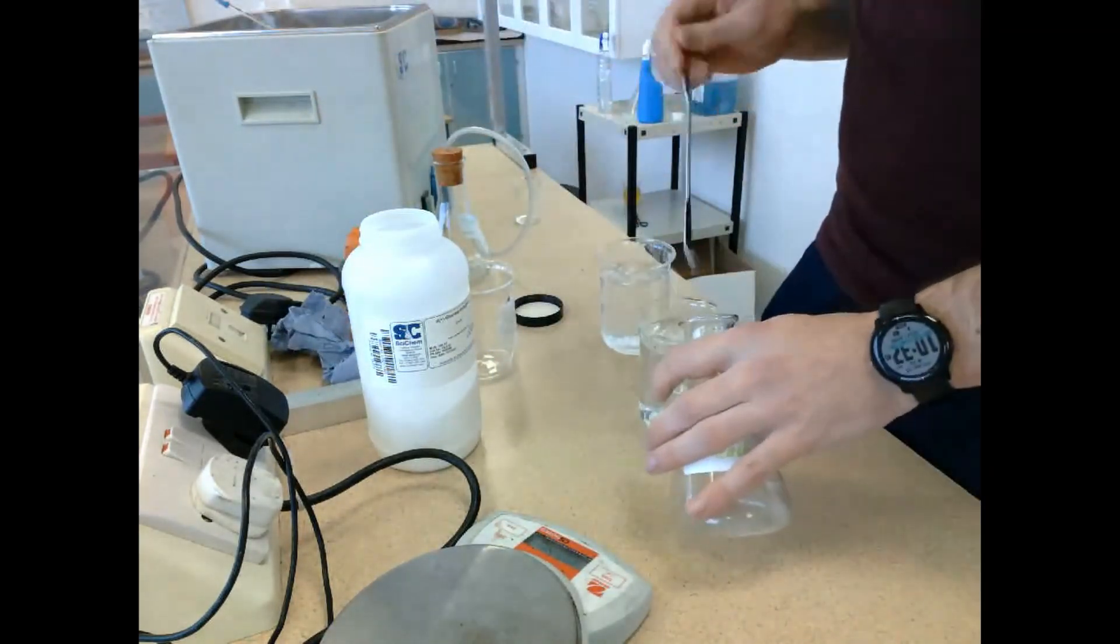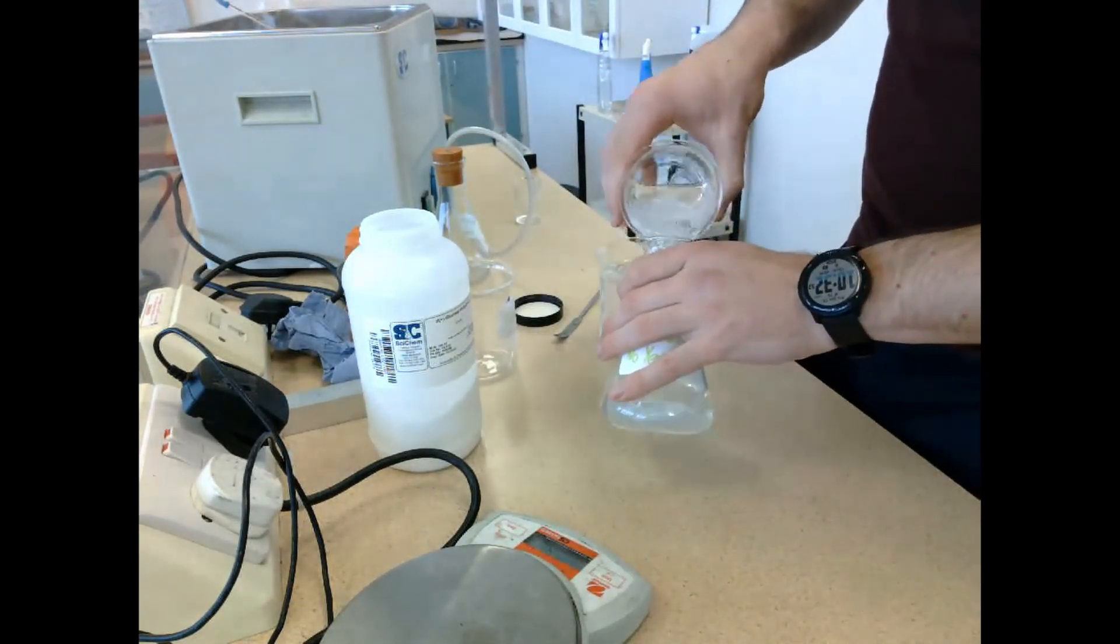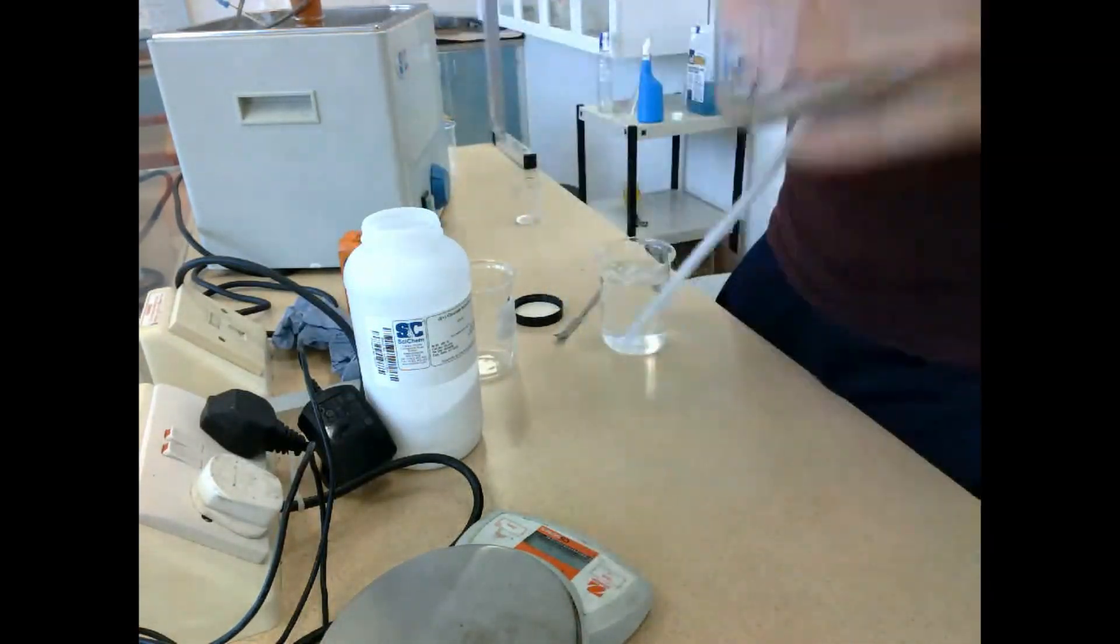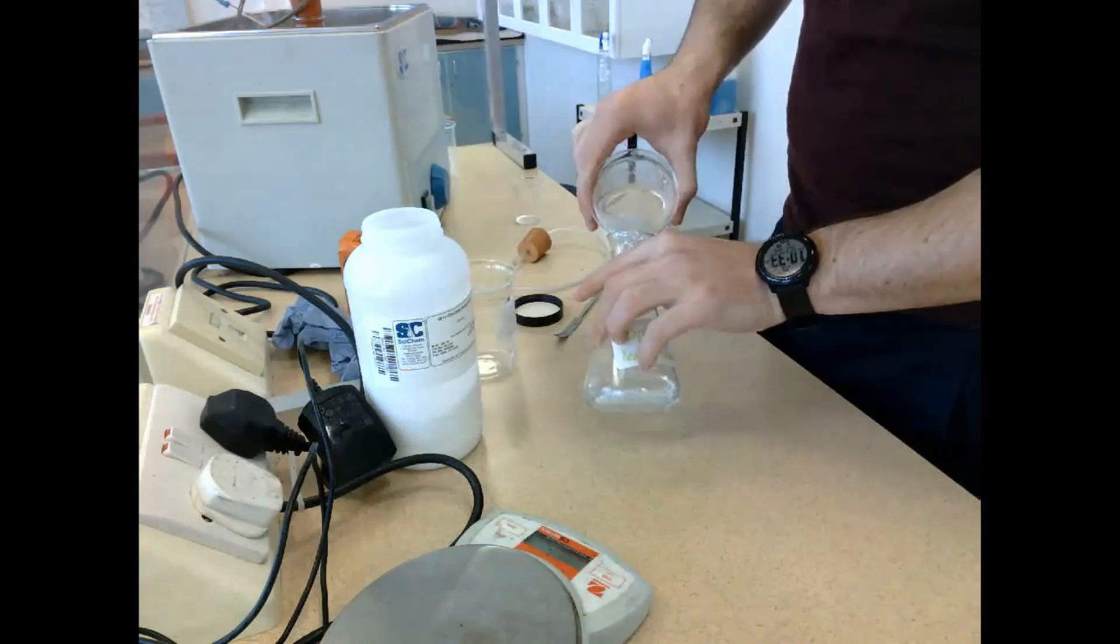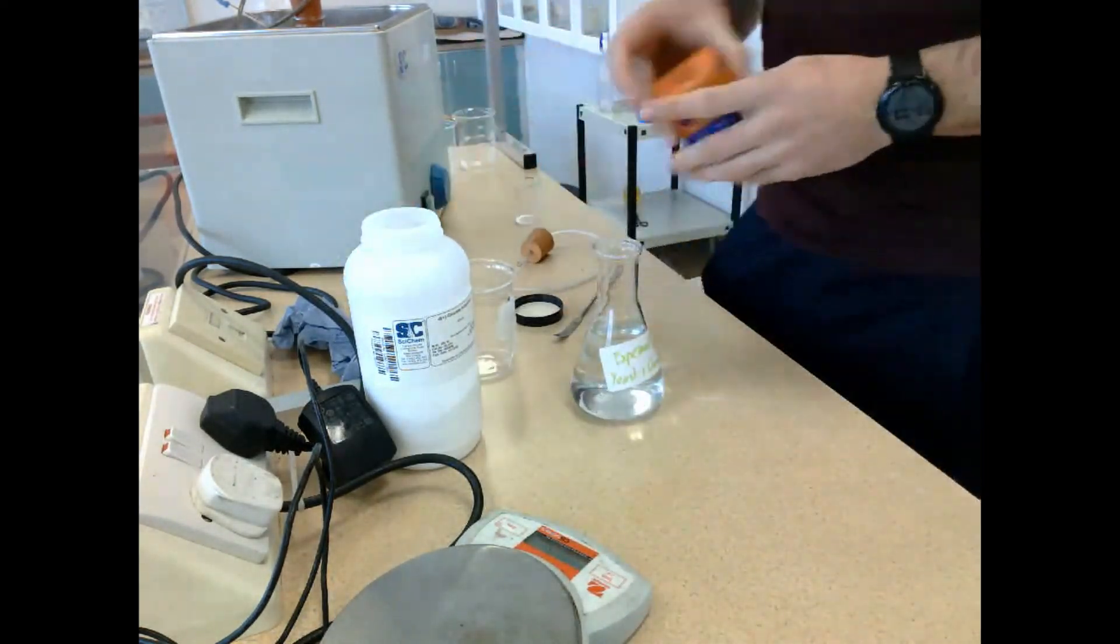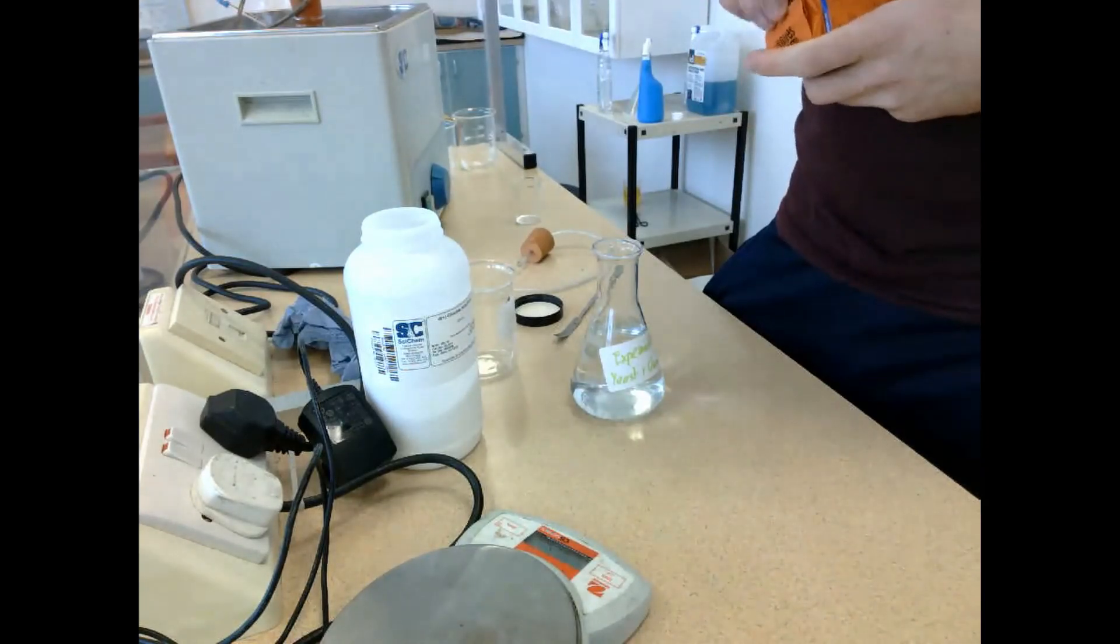Once we're happy it's dissolved, we then take our conical flask and we add the first beaker into the control flask. This is just going to be glucose in boiled water and it's going to be placed in the water bath at 25 degrees for the duration of this experiment.